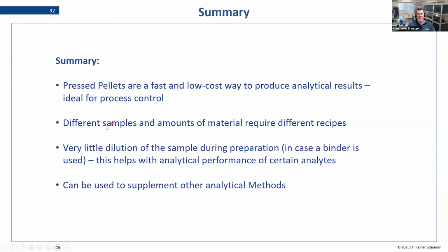Depending on the sample amounts and the material, you will have to choose a fitting recipe. There are various ways you can do that, but you want to choose one that fits your material and amount. One advantage we have in analytics is that we have basically the pure sample. It's not really diluted by any agent like in other methods, and so this helps us, especially with the light elements.